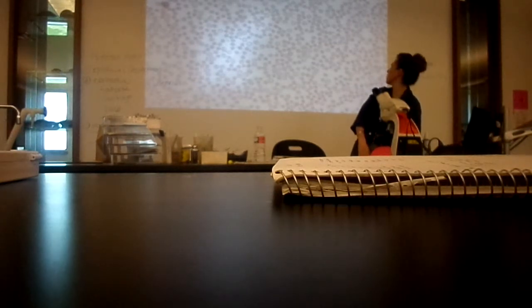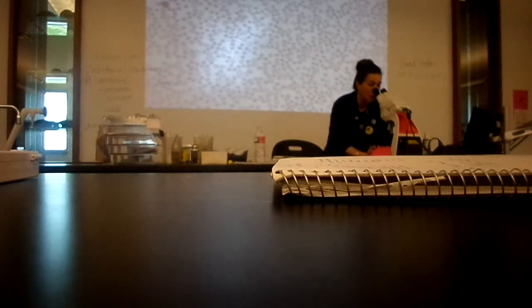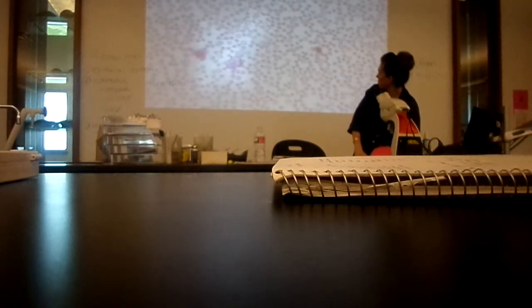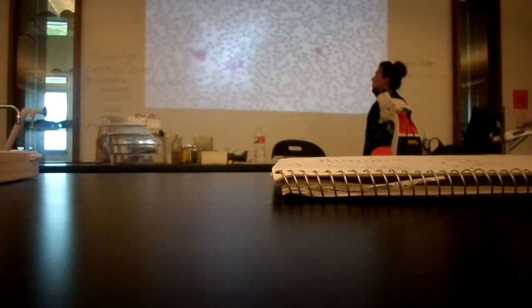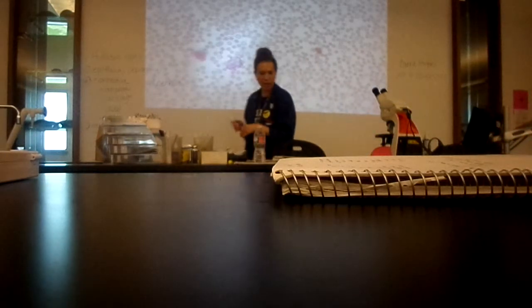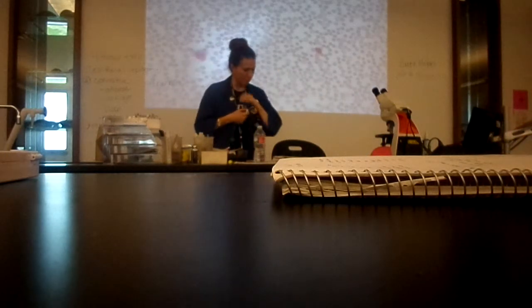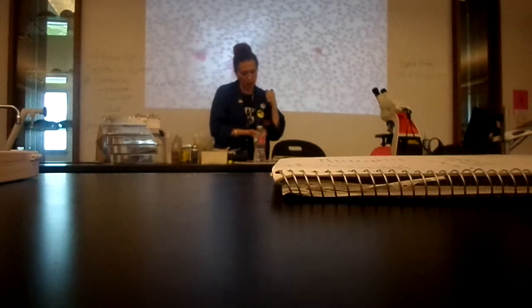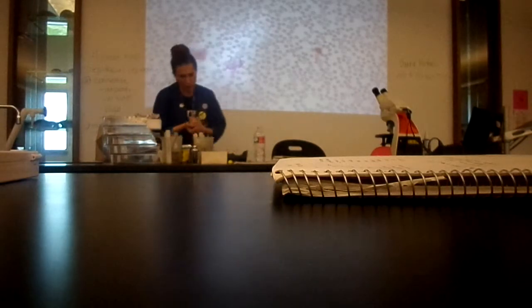Draw and label everybody. The blood cells are pretty tiny. Yes, they are. Are there some white blood cells and big red blood cells? Yes, there are. There's 3 things you need to know in this one. First of all, this is blood. Okay? The general tissue is blood. You have 3 parts, 3 cell types that you need to know.